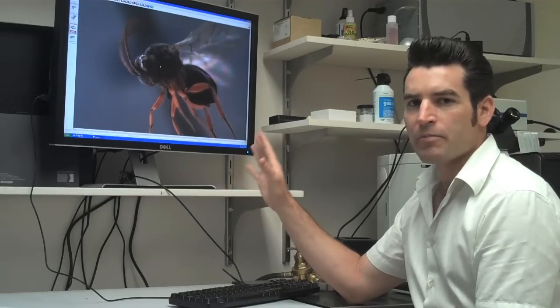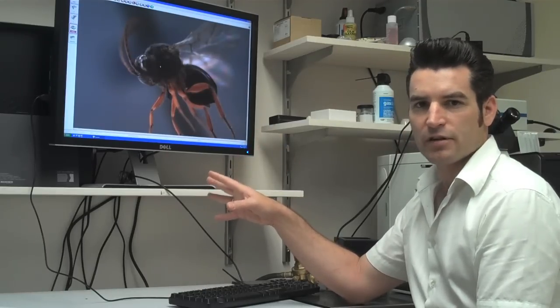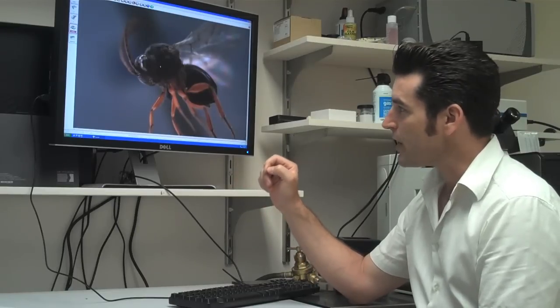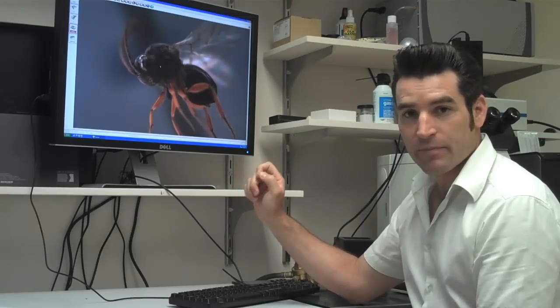Sometimes there's some post-photography editing that has to be done. But all in all, it produces an image that is close to the resolution of a scanning electron microscope, not quite. We'll never be able to achieve that, but we have the added advantage of them being in color.